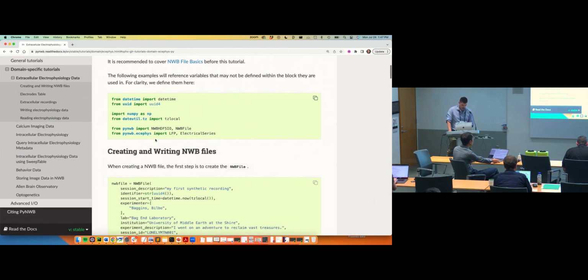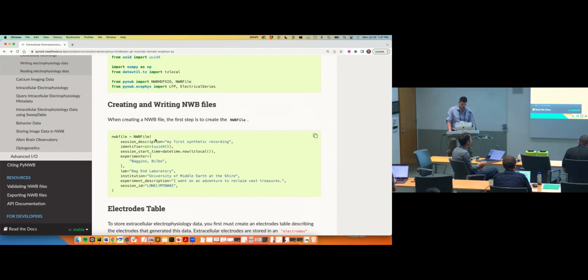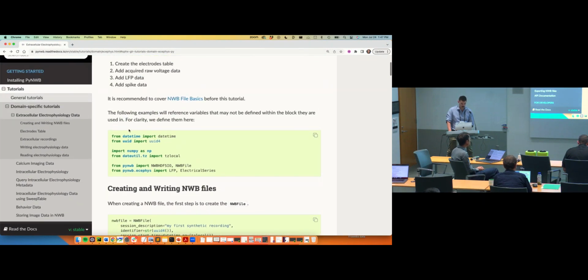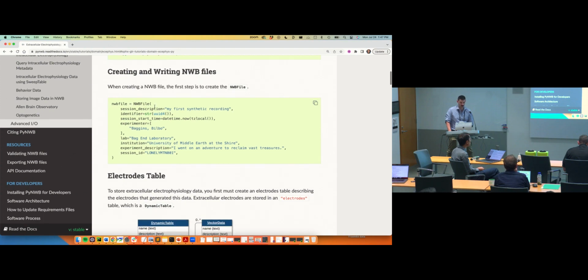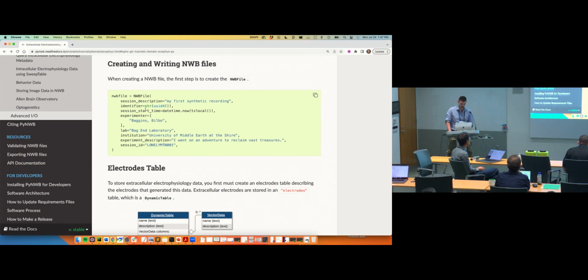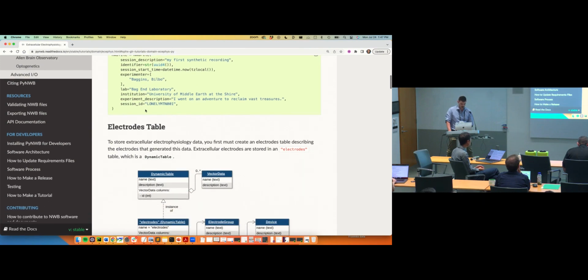All right, so we have some imports. This is largely going to build upon the tutorial that Ryan just gave. I guess if you're watching this on YouTube, check out this tutorial first. The one thing we're going to copy over is just the creation of the NWB file, because we just need that NWB file object. You'll likely also need things like a trials table, which you can learn about in the previous tutorial. But we're just going to jump right into extracellular electrophysiology.